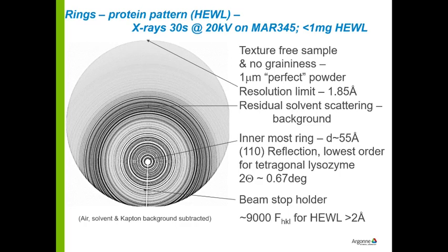The original basically looks like an old record, or a CD, because there's so many lines on it. Very spectacular pattern. It was collected in 30 seconds or something like that, let's say.